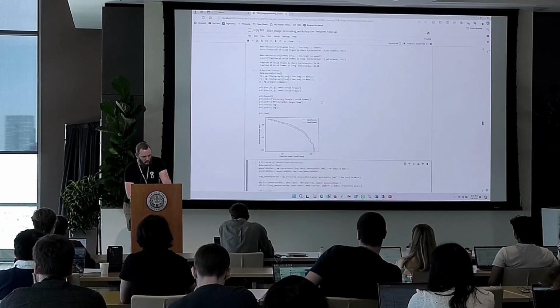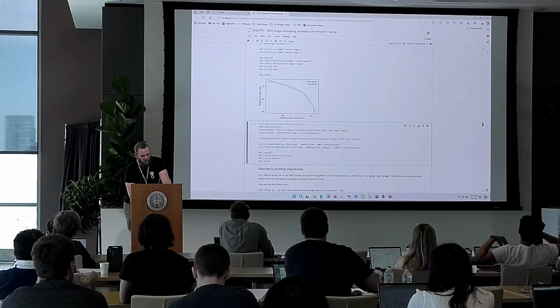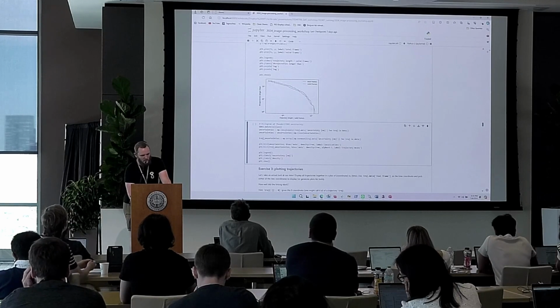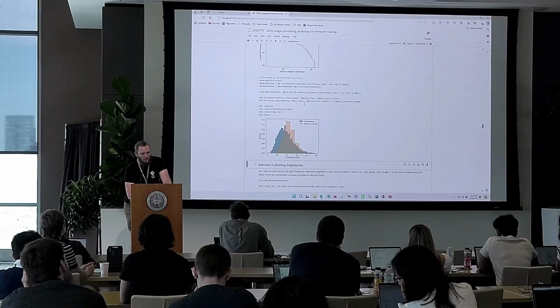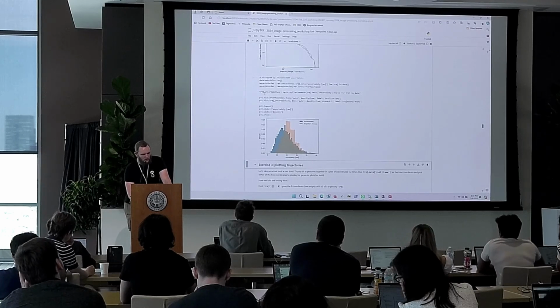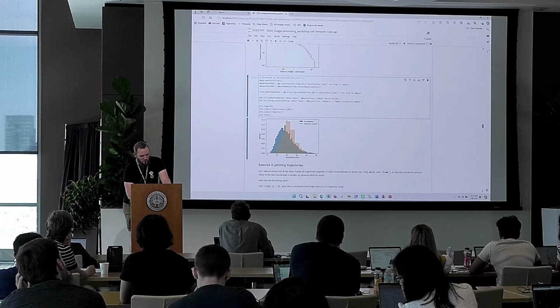We can again plot survival curves in terms of total number of frames or number of valid frames. You see these track each other very closely. That's also nice. And finally, we can plot a histogram for the localization uncertainty that thunderstorm reports. This is just some meta information on each trajectory.